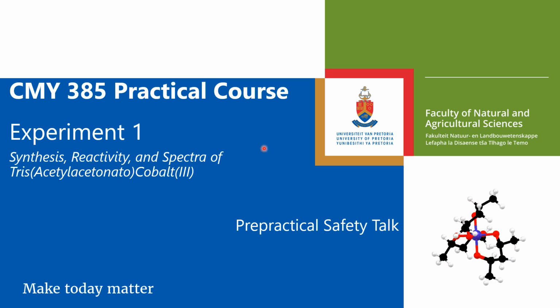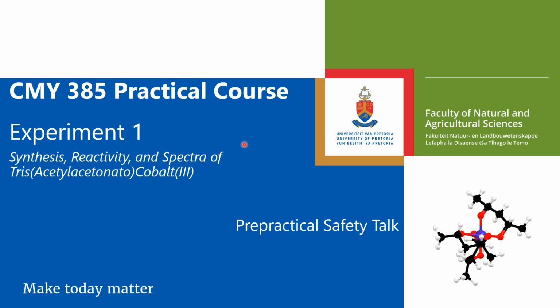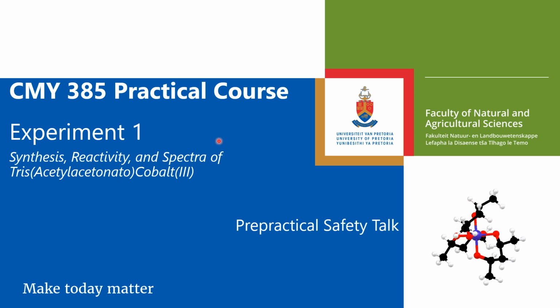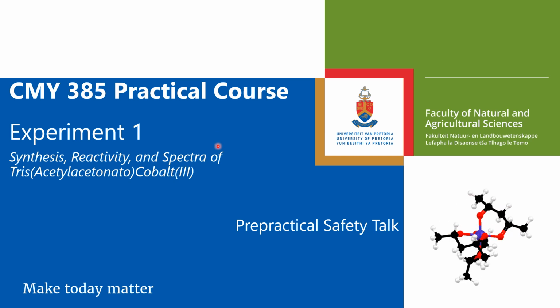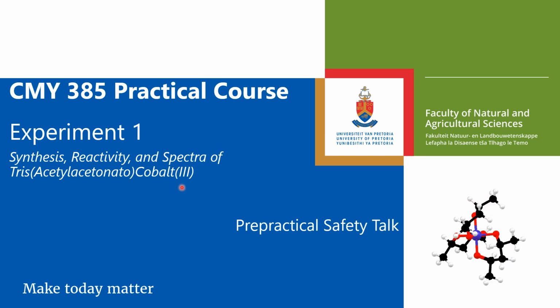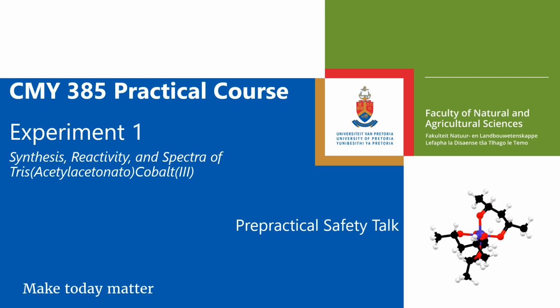Hello and welcome to the CMY 385 practical course. This will be the pre-practical safety talk for your first experiment, where you will cover the synthesis, reactivity and the spectra of tris acetylacetonato cobalt as well as its nitrated derivative.